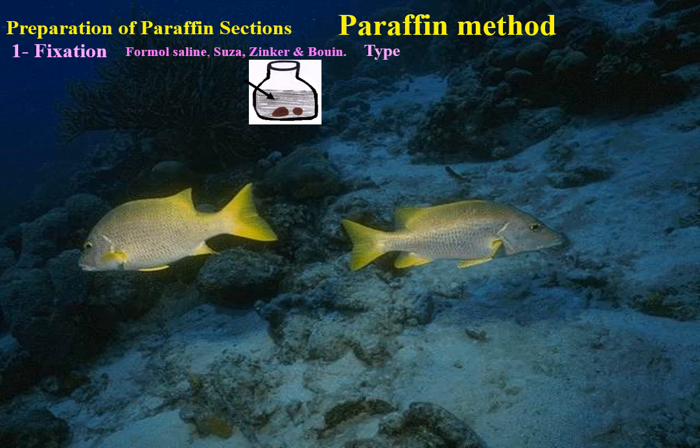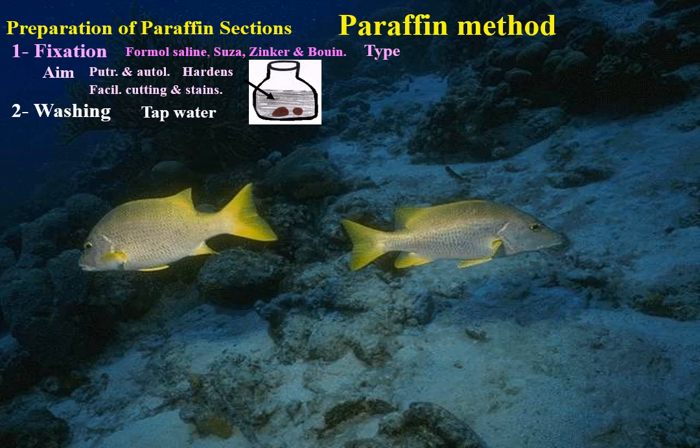Also, the different stains. Fixation prevents putrefaction and autolysis of the tissues by coagulation of their proteins. Also, fixation hardens the tissue, facilitates cutting, and increases its affinity to different stains. Washing is done by running tap water to remove the excess of the fixative.